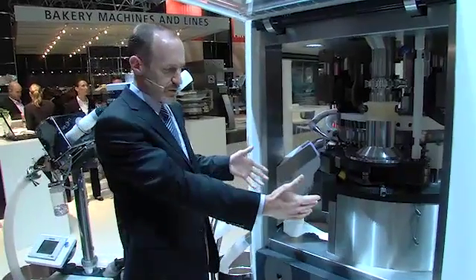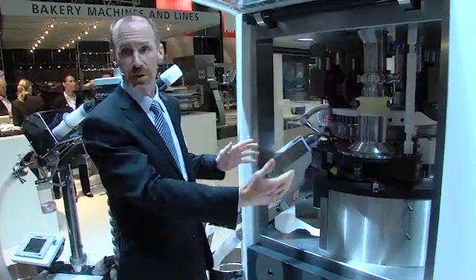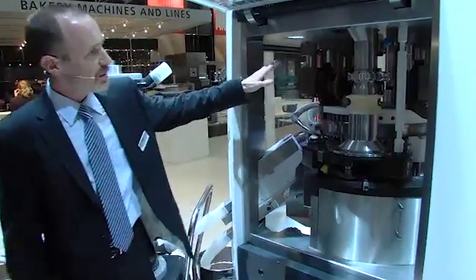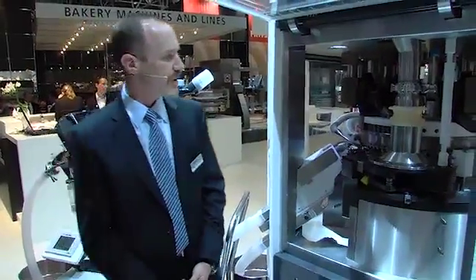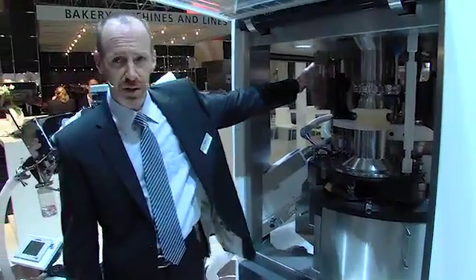The first thing that generally would strike a viewer when looking at this press is that its footprint is somewhat compact, given the potential output of the machine. The machine will run and operate in three basic modes: conventional compression, monolayer compression with pre-compression and main compression.